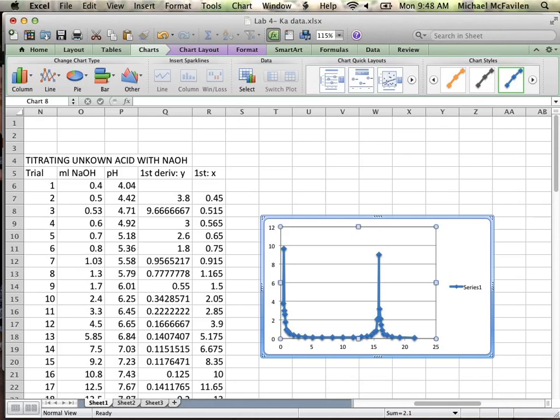Did you say theirs was di? There's an acidic hydrogen there. Okay? So it turns out that your unknown acid is a diprotic acid. And that when they gave it to you, the unknown, it still had some of the diprotic species in it. That's what we're seeing at the very front. Okay? We don't care about that value. In theory, you shouldn't even see it. Okay, so there's a few of you that have that showing up on there. You can ignore it. Take a look only at the other section.